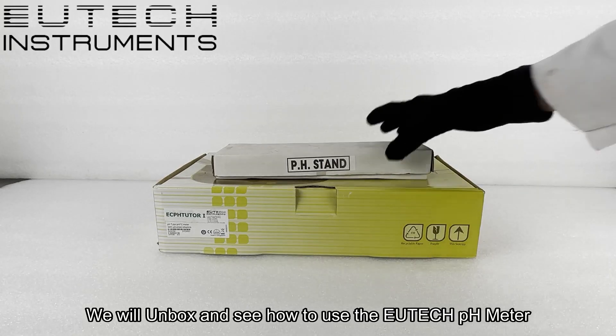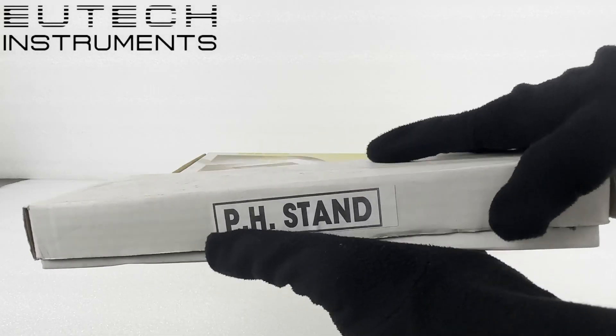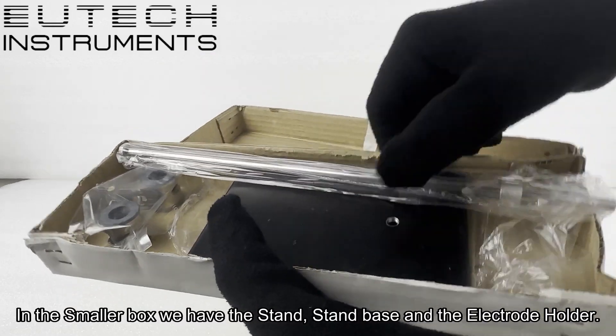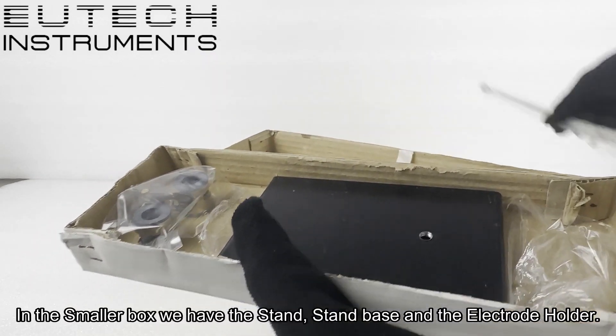We will unbox and see how to use the EUTECH pH meter. In the smaller box we have the stand, stand base, and the electrode holder.